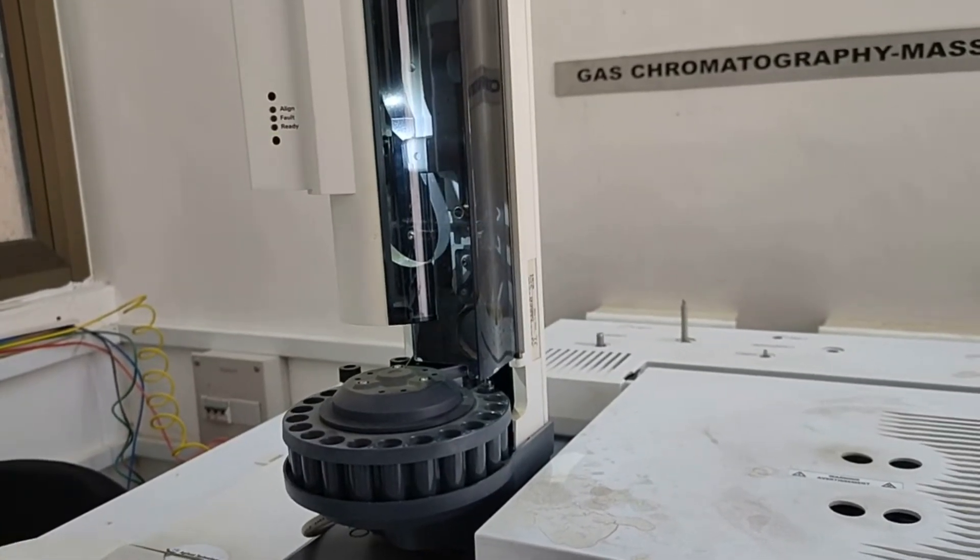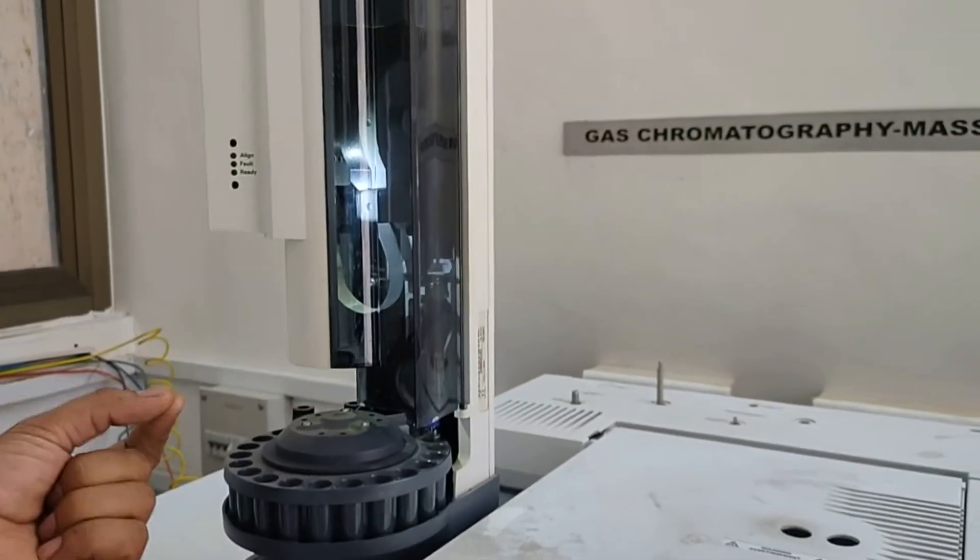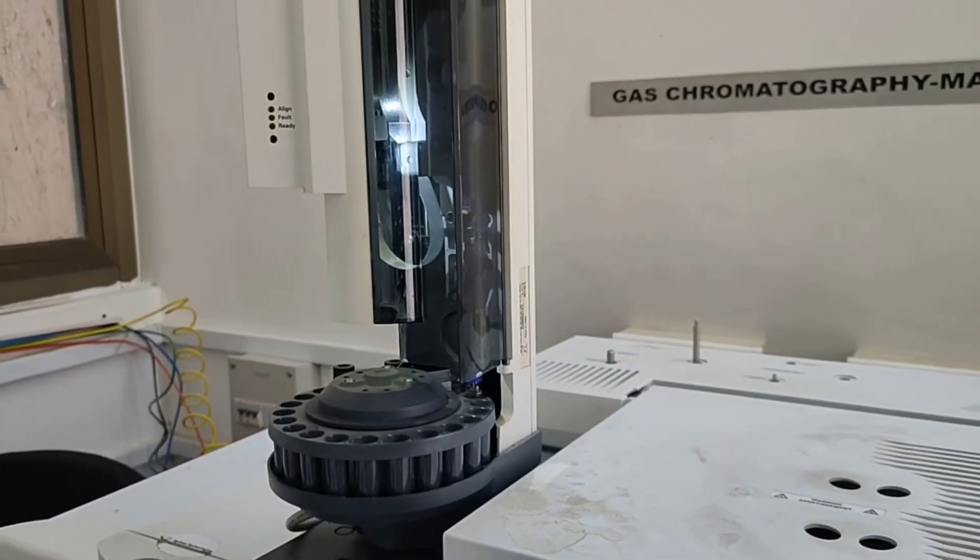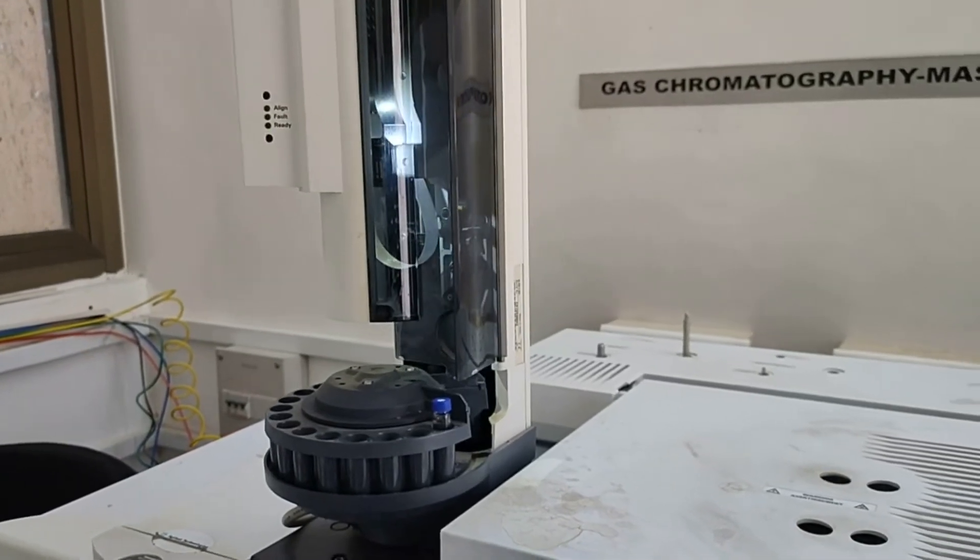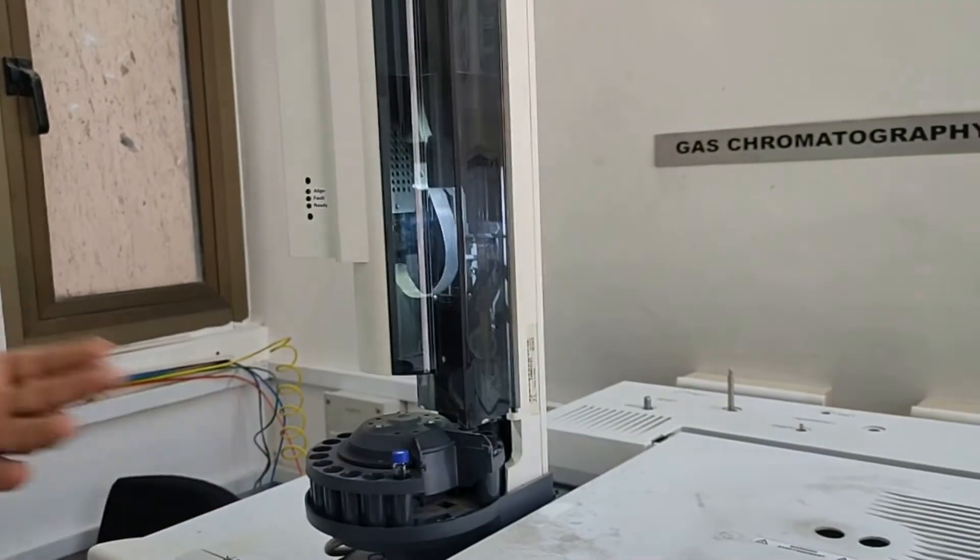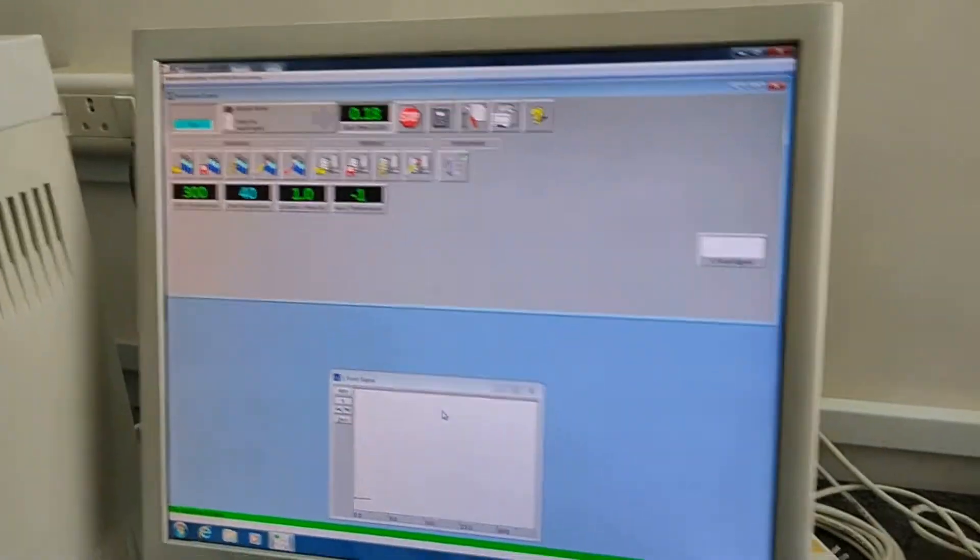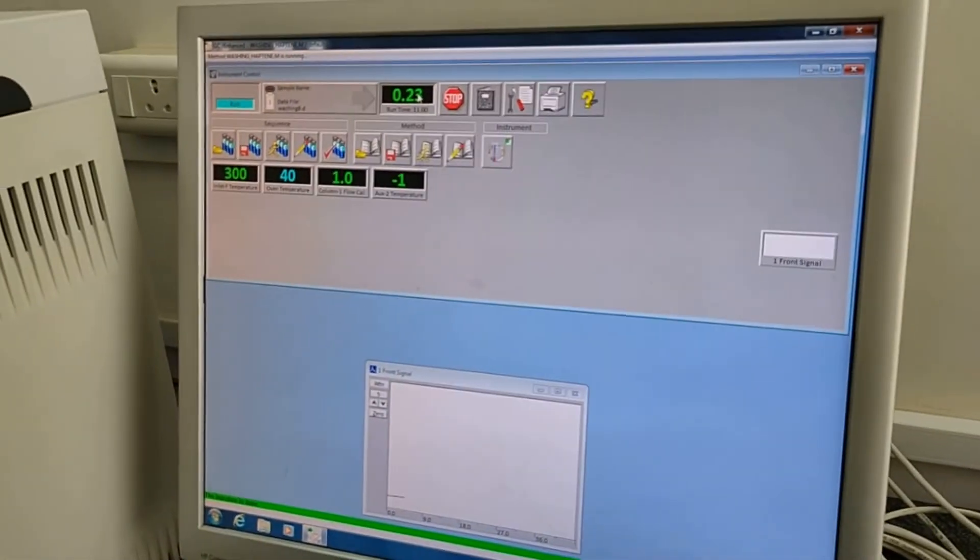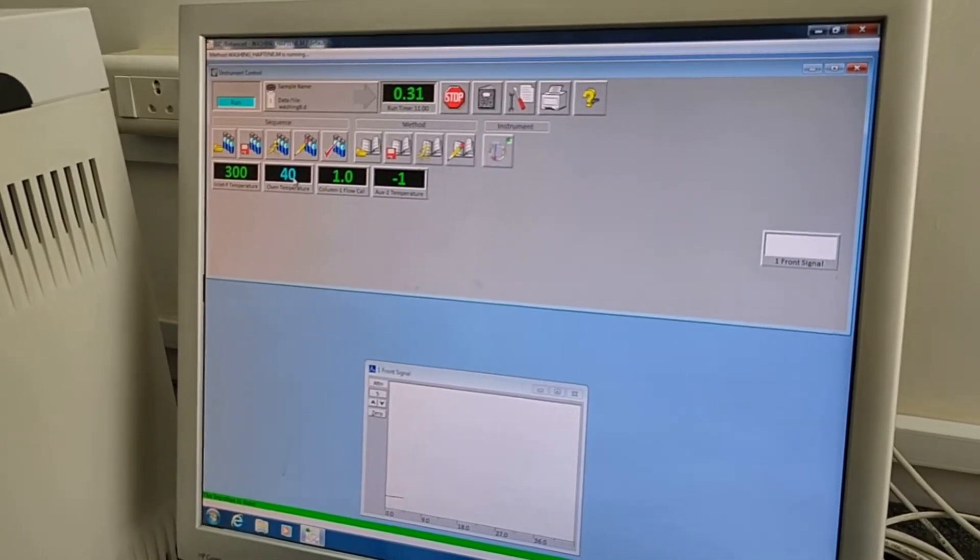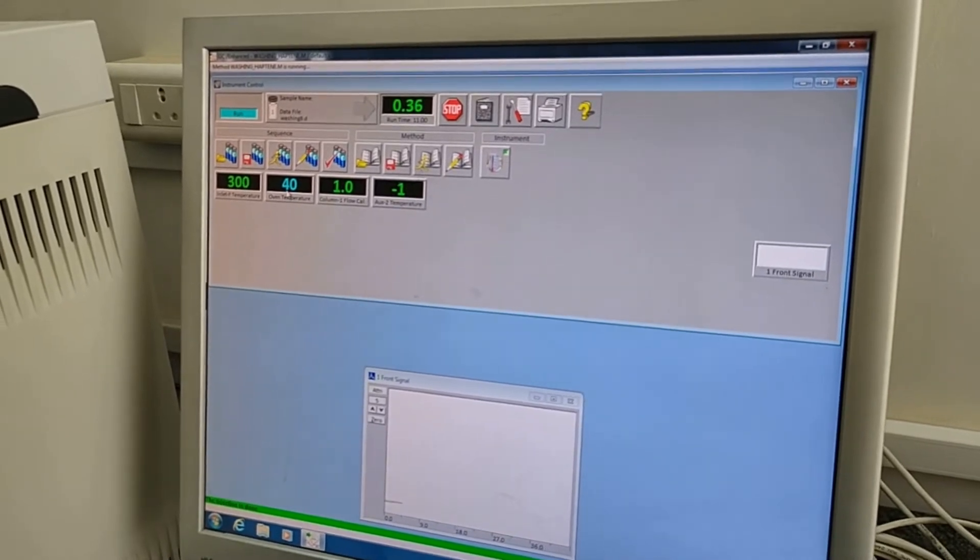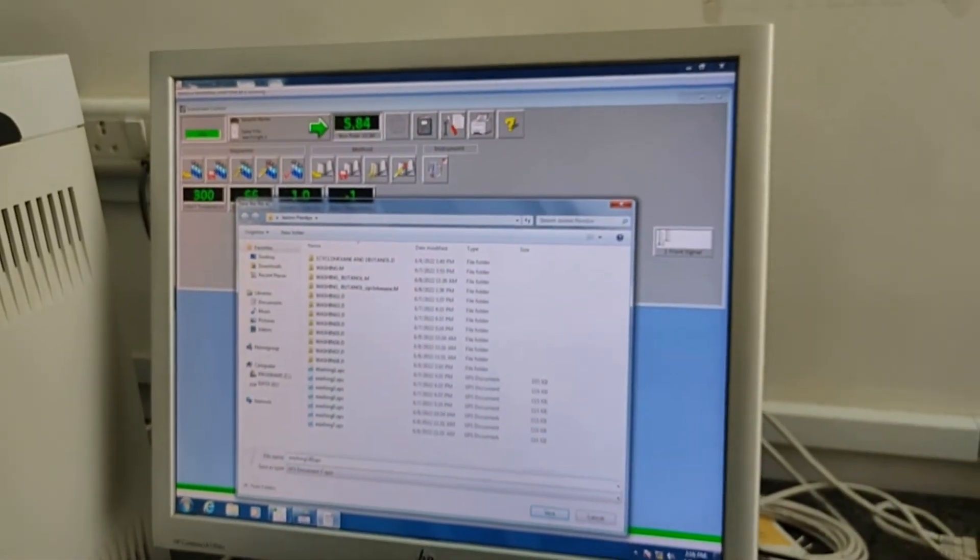Now after that, 6 times pumping in the sample so that if the air is coming in the syringe so we remove. Now take it and then after fill it in our system. After that is the 5 times washing part of our syringe. Now you can see here, time starting. Now we have set at the total 11 minute running program. Inlet temperature, oven temperature 40 degrees. Now increasing one by one. Now after complete the process this time window is coming, you just save this file name.